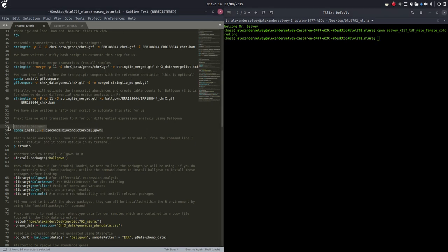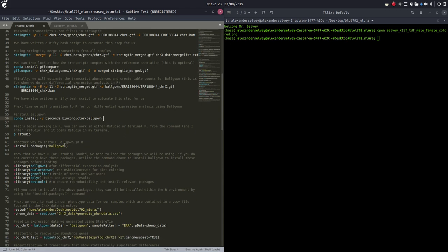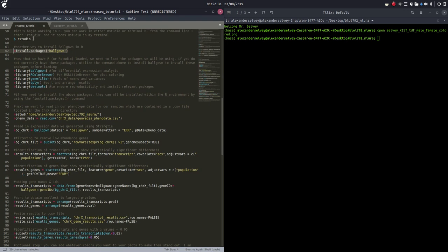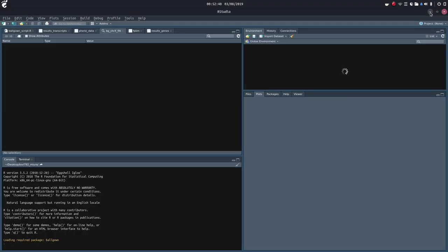Last time I said that you can use Conda to install ballgown if you'd like to in R. If that doesn't work for you, I've also included some code so you can install the ballgown package directly in R. We're going to be working with RStudio today, so I'm just going to open up RStudio — just type that in the command line right there.